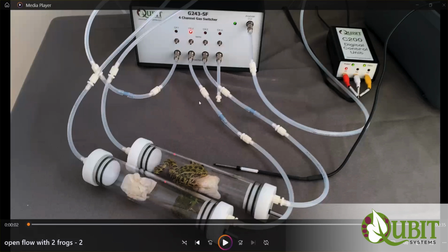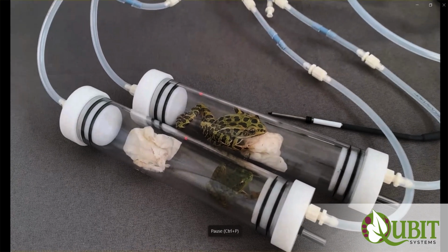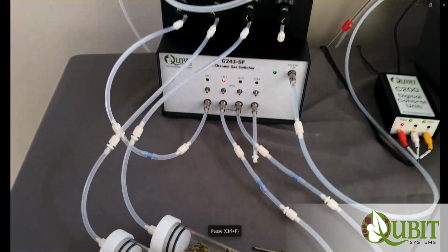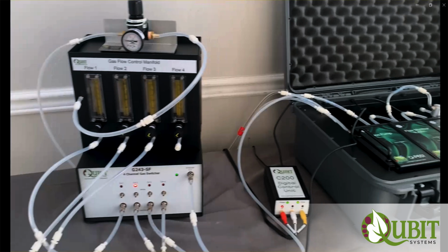2 and channel 3. Channel 1 was our reference where there was no chamber attached, just the reference gas flowing, and you can see a temperature probe here placed between the chambers. I'm just going to run this little video so you have an idea of how this system was set up. You can see that on channel 2 we had a smaller frog, and on channel 3 we had a larger frog.